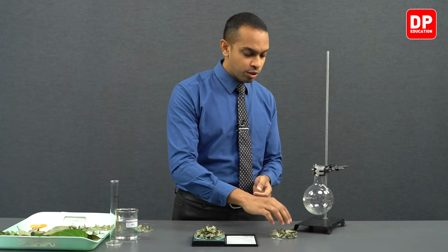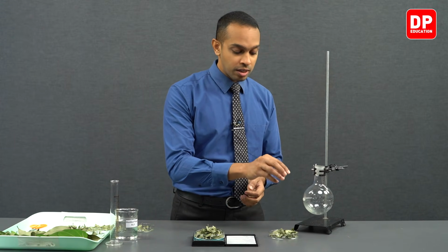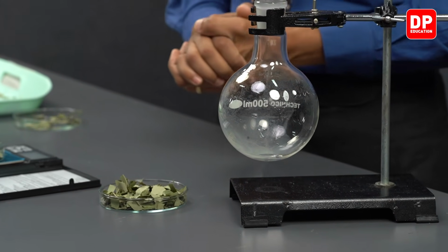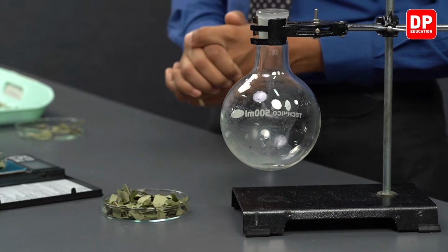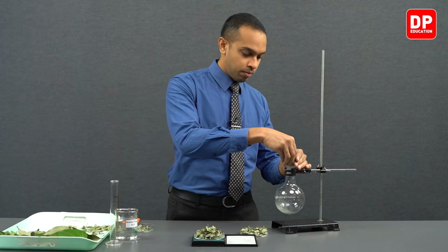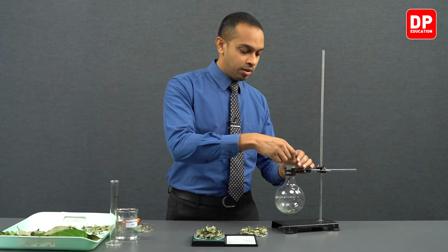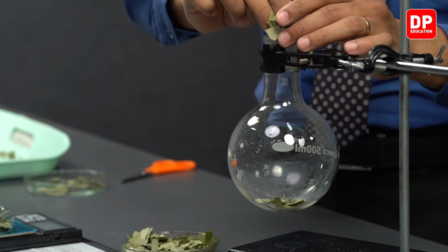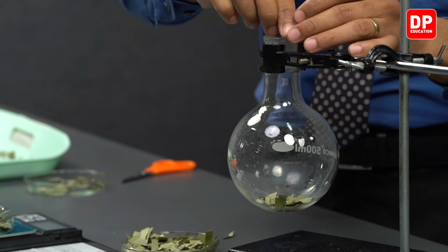So let's transfer these cut pieces of cinnamon leaves into our round bottom flask that we have here. Little by little, we can insert our cut pieces of cinnamon leaves into this round bottom flask.